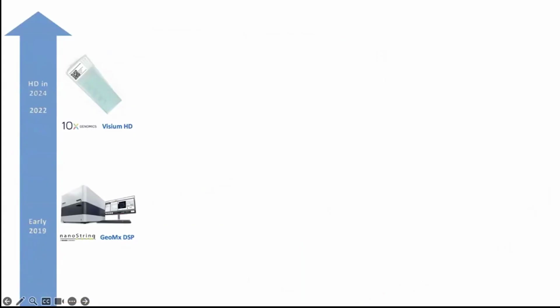So you will have the choice between the GeoMx DSP, which uses high throughput next generation sequencing and a digital barcoding approach to provide gene expression. It leverages fluorescently labeled probes to identify RNA or protein markers within specific tissue regions, which I said previously are called ROIs, regions of interest. The Visium is based on spatially barcoded tissue slides that allow for whole slide RNA profiling. The tissue is placed on a slide with an array of spots that each contain a unique barcode.